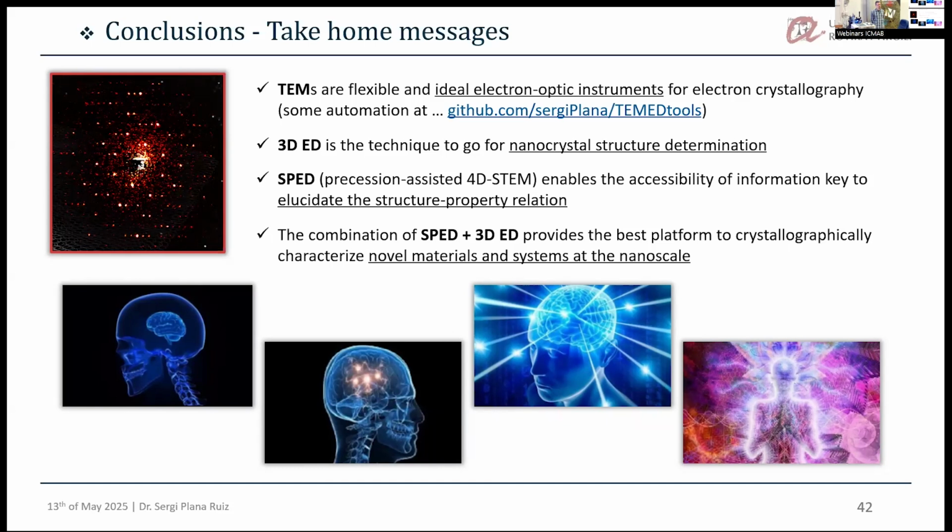Beam sensitivity is really a problem, for organics, also for MOFs and other more fragile materials, definitely. But if you have a system in which you illuminate your sample only when you need it, and you have a sensitive detector coupled with a very low, not that bright, electron beam, then you can obtain diffraction data.